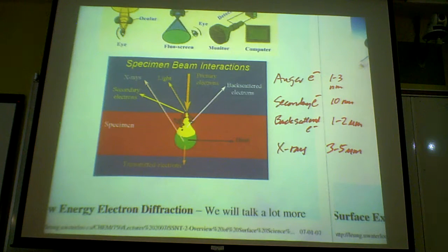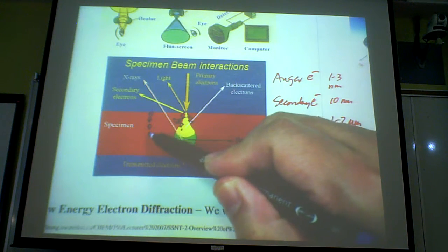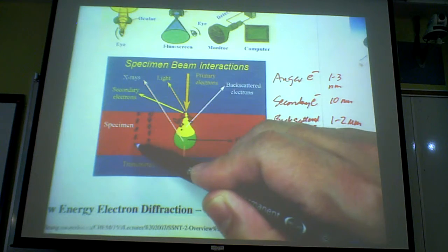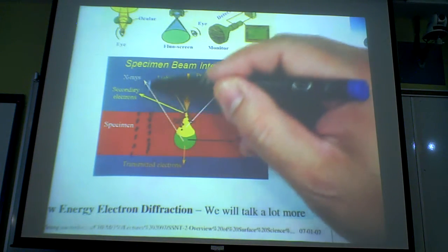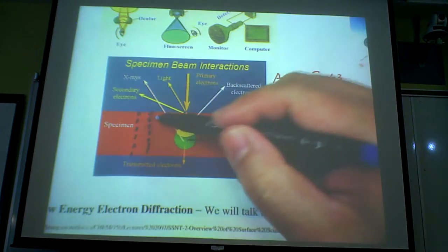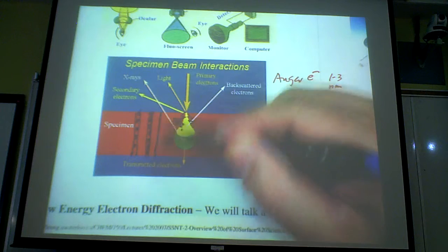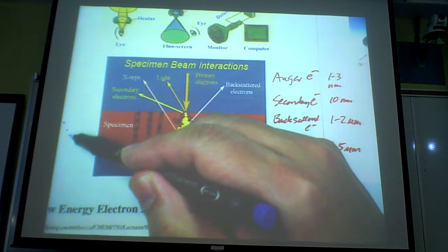As I was talking about before, if your atoms are lining up like this, you have columns of atoms, your lattice lining up like this. When you do TEM, you're looking down from the top. I'm plotting a side view here, so you are really looking at columns of atoms. That's what I meant by columns of atoms.